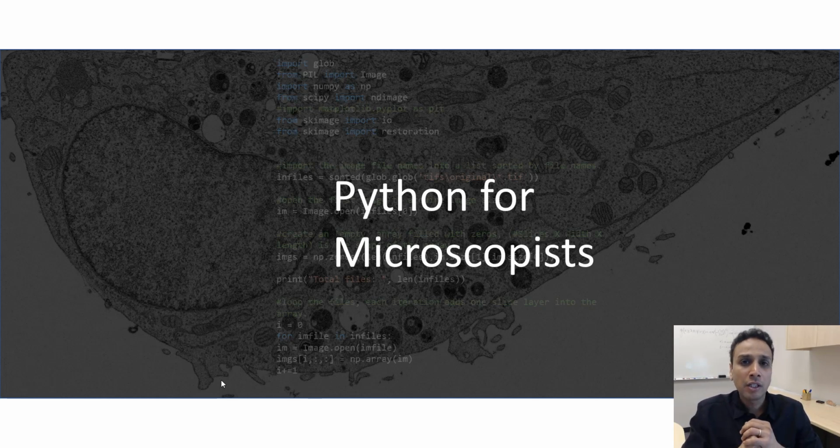In today's tutorial, let's have a look at a few image denoising filters, because oftentimes in microscopy we have to make a choice between speed and signal to noise. And of course, you want to collect publication quality images, but not all the time. For most of the time, you want to collect images so you can extract relevant information.